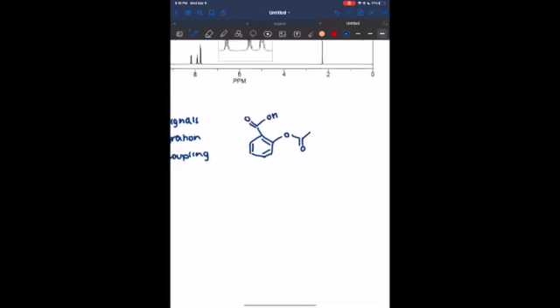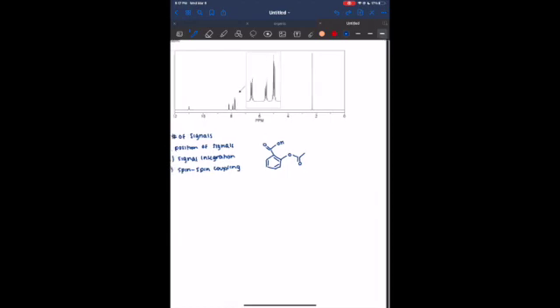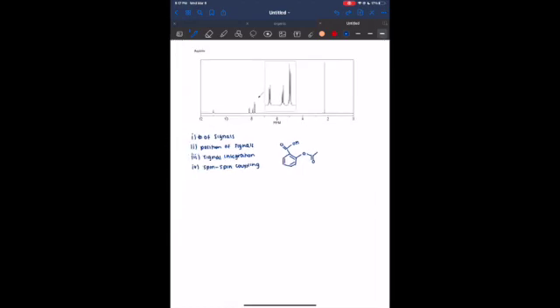So now, using all the stuff that we just reviewed, we're going to go over this molecule aspirin, and this is what aspirin looks like. We can see that there is an ester, there's an aromatic compound, and there is a carboxylic acid. So we're going to see all those on the NMR and determine those through the position of signals as well.